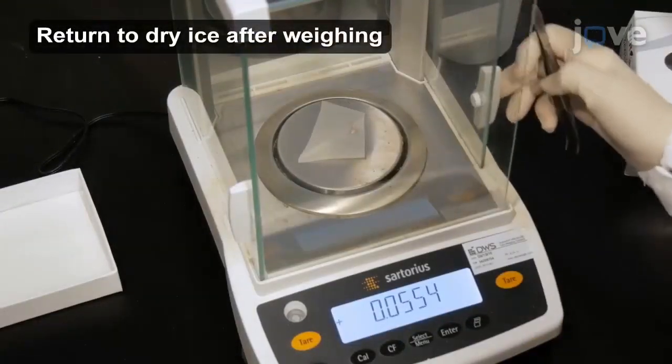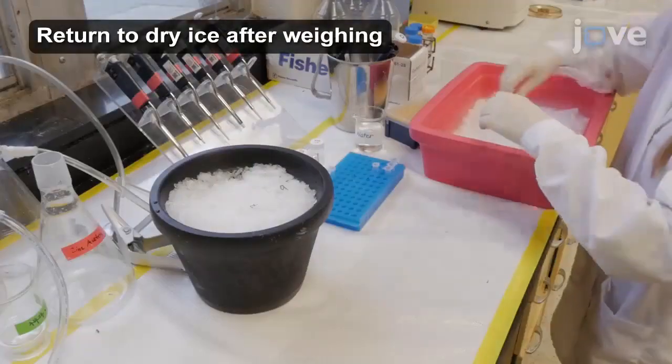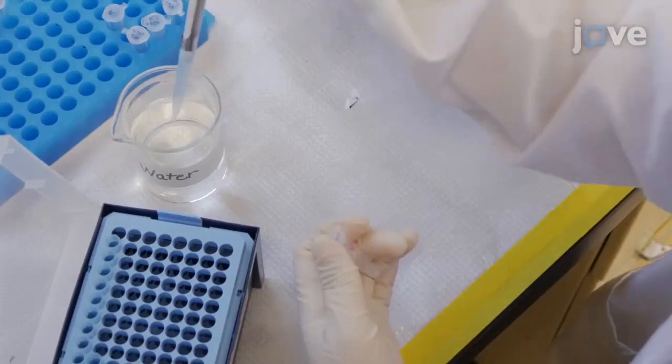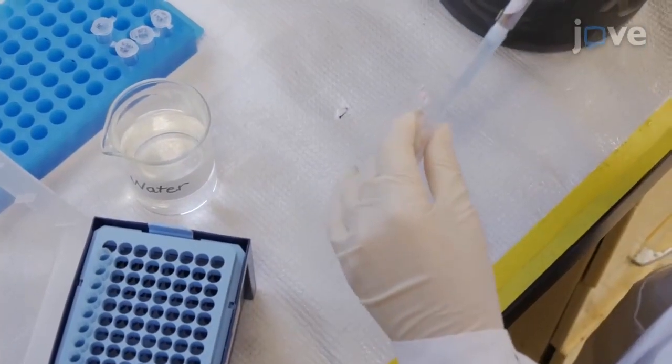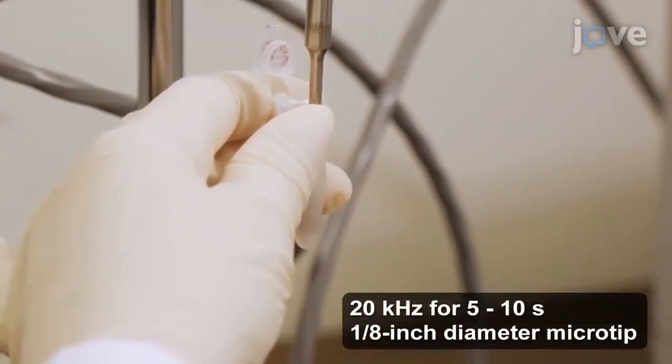individually weigh each sample on a precise analytical balance. When all of the samples have been weighed, move the tubes onto wet ice, and dilute each tissue sample at a 1:10 weight by volume ratio with ultra-pure water, followed by homogenization with a sonicator.